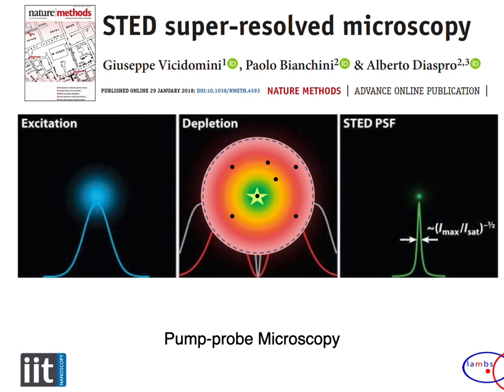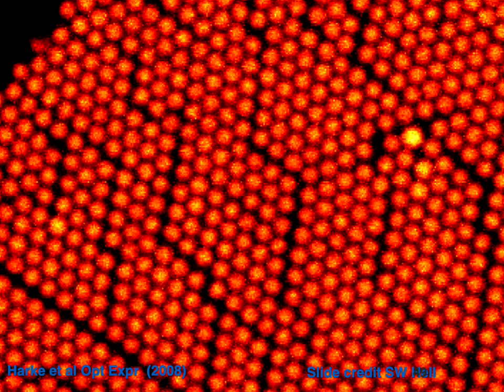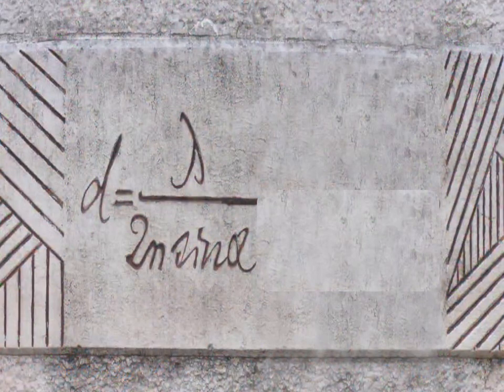So at the very beginning, the brush of you, pointillist painter, is the one you see here. And if you play this game, your brush becomes sharper. But what I like of this method is the fact that with the best confocal microscope you have this image, you switch on the second beam, and without any calculation, in case of single molecule you need hundred thousands of calculations per point, immediately you see better. Do you remember the Abbe formula, even if Abbe never wrote it?